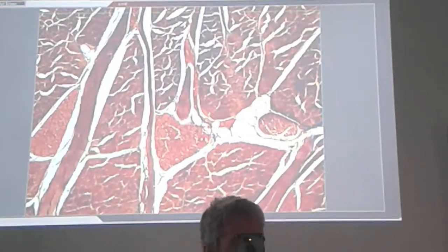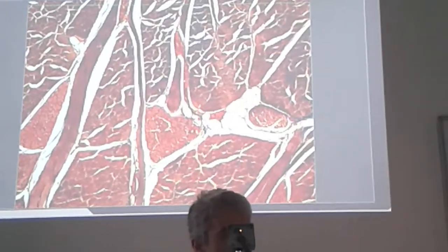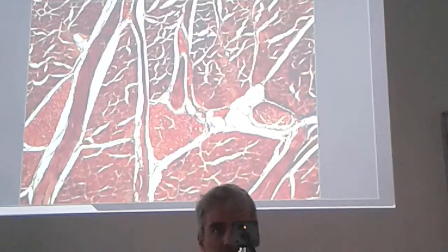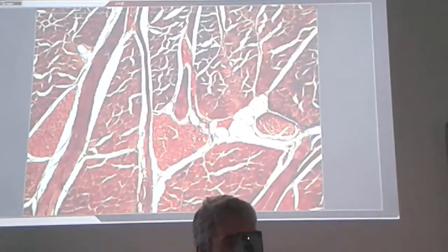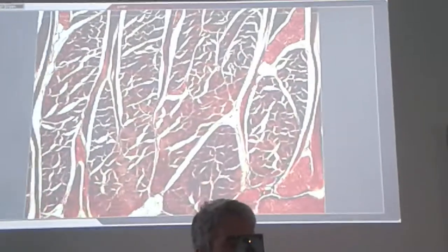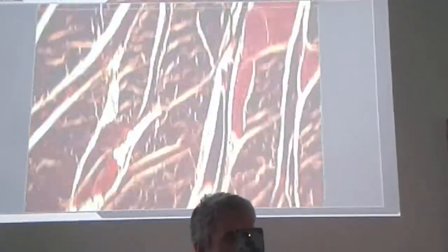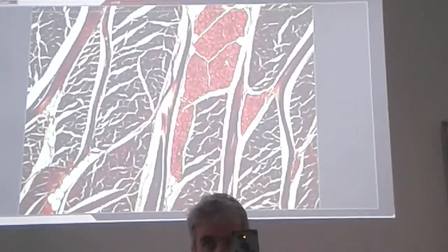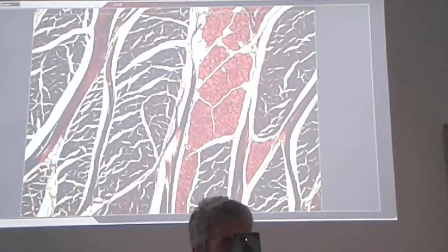Those muscle cells are the striated type of muscles, so the organ itself has a motility function. And there are other small sections of blood vessels and blood capillaries, and if you go deeper you can still observe some glands.